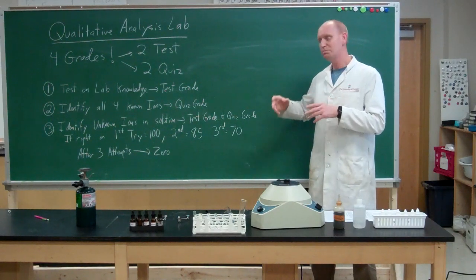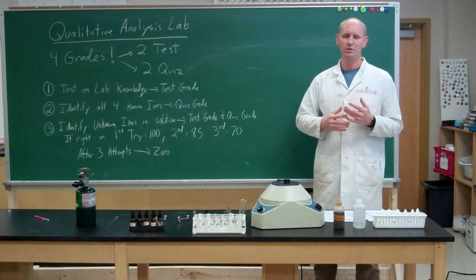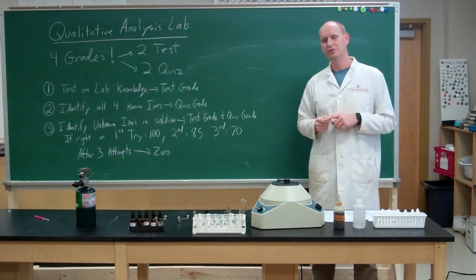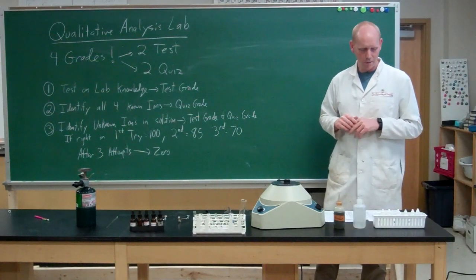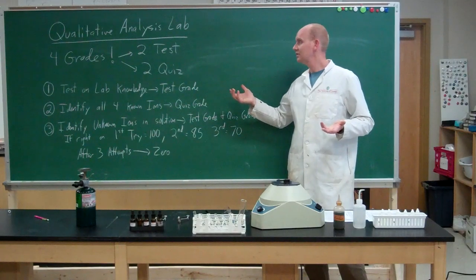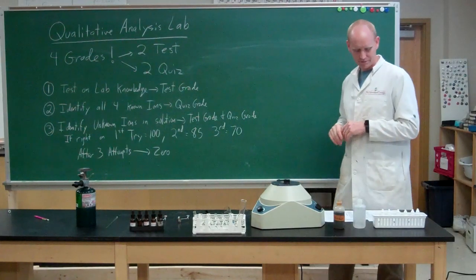Now, after the base precipitated ions, then you have carbonate precipitated ions, which are Group 4 ions. Things like magnesium carbonate and calcium carbonate are carbonate precipitated ions. And then our Group 5 ion is anything that's not precipitated out as a chloride, an acid sulfide, a base sulfide, hydroxide, or carbonate. Now, do you need to know that for the quiz? Absolutely not. You just got to know that, hey, we're using some bases to precipitate out. You don't need to know what the groups are. But it's a kind of neat little fact.